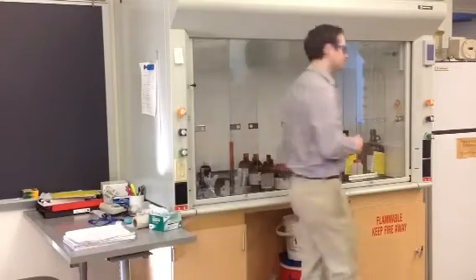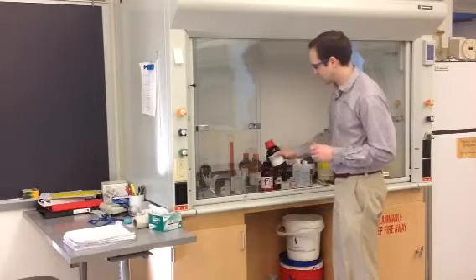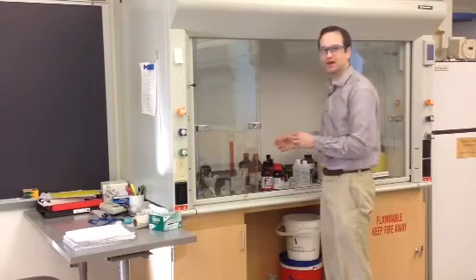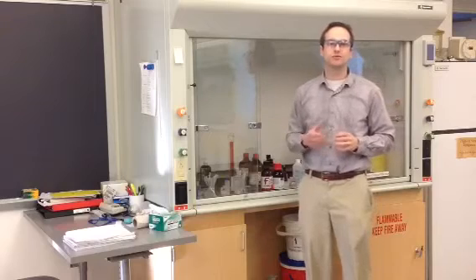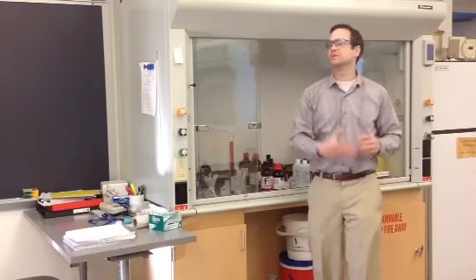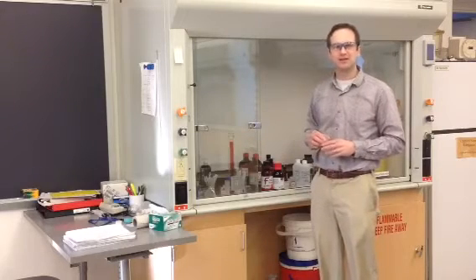There's going to be a graduated cylinder right there for you. So you take your carboxylic acid, and with gloves on, you pour it into the graduated cylinder. You have your round bottom ready to go, you pour your solution in, cap it, and then take it back to your hood. Also, when you're done with your carboxylic acids, take off your gloves and leave them in a container in this hood. Just take them off, throw them in. I will dispose of them later. Do not throw them in the garbage, or else the garbage will start to smell, and then the lab will smell, and then the building will smell. Everything with the carboxylic acids needs to remain in the hood.